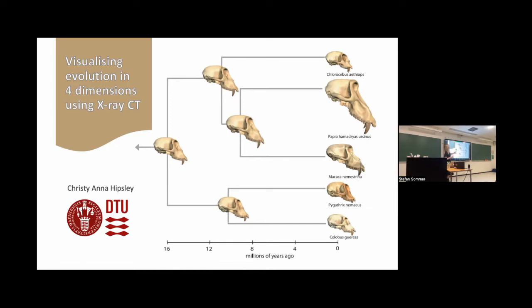And this is just a very nice visualization. It's not mine, but you might recognize it from Landmark Editor. That was one of the first open access 3D landmarking software, which now is Stratovan Checkpoint by Dave Wiley at UC Davis. But it sums up the things that we want to use digitization for. So we have 3 dimensions, and then we can translate that into evolutionary time.